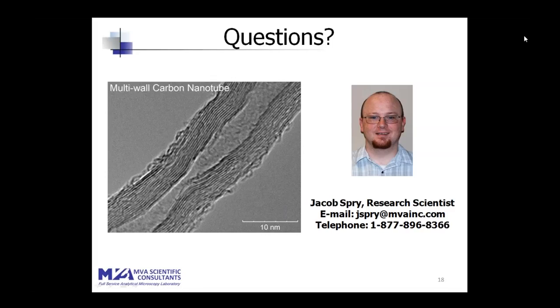So unfortunately, the answer for me is no, I have not looked at anything like polystyrene. What I can add on to that is we have looked at a lot of different polymers with the TEM in-house, with a heavy metal staining to look at these different copolymer blends in the mixture.